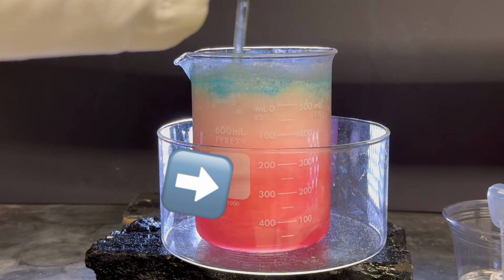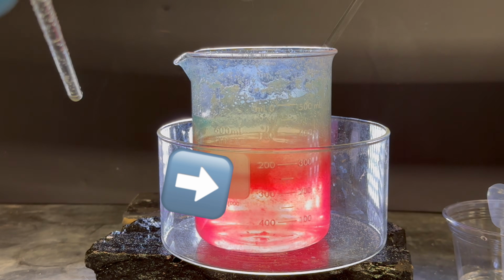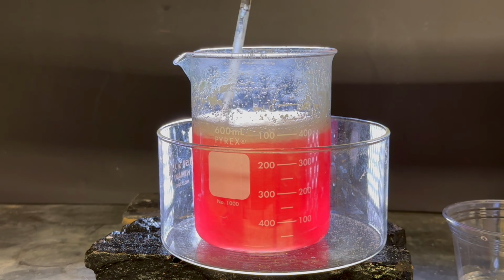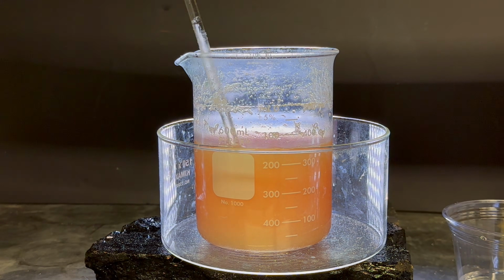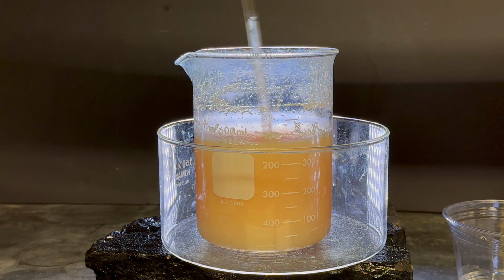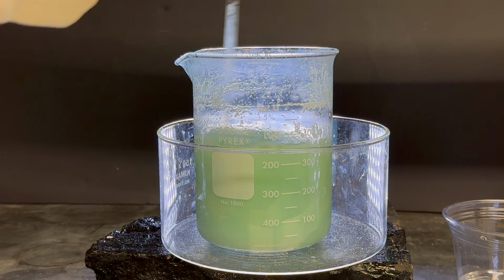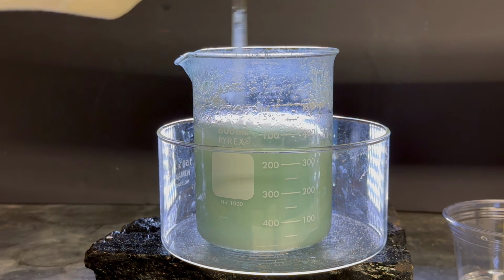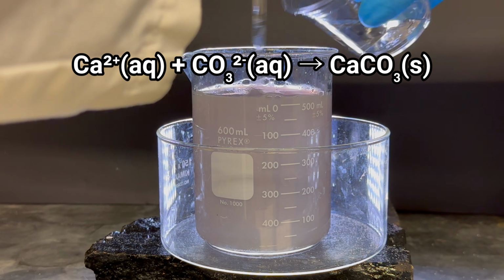Watch carefully here. You'll notice that the carbonate dissolves when it reacts with the acid. But check this out. When the acid is finally neutralized, a solid forms, and this time it stays. You can see this solid by noting the cloudy appearance that's in the liquid now. You can also tell the acid has been neutralized because the indicator has changed to a green color. The solid formed is calcium carbonate, and the calcium in the calcium carbonate came from the deer tooth.